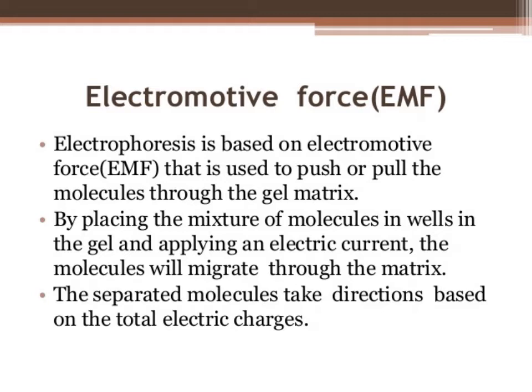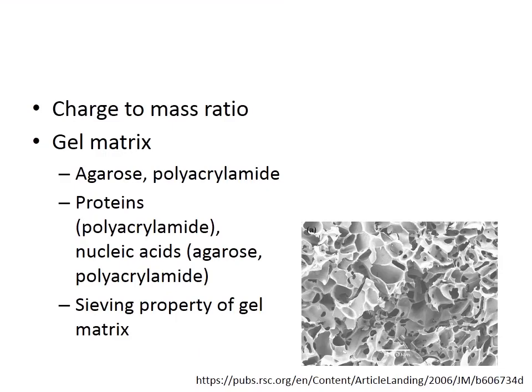Migration of the molecules within a gel during electrophoresis is dependent upon their charge to mass ratio. So charge to mass ratio is an important factor in governing the rate of migration of molecules in a gel.